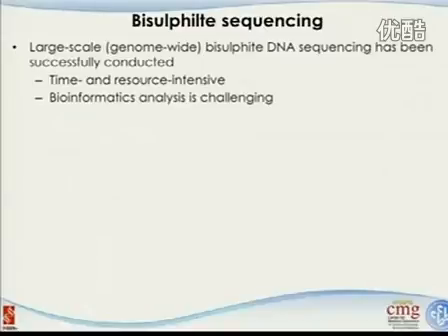It's about bioinformatics analysis. If you think it through, the human genome has 4 letters, A, C, G, T. And we were talking about alignment for almost an hour, and we still don't know how to do it, right? This is a very daunting task.